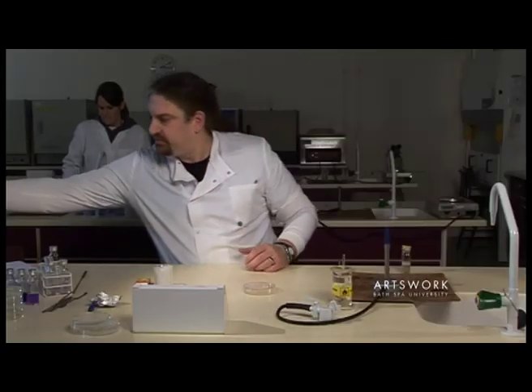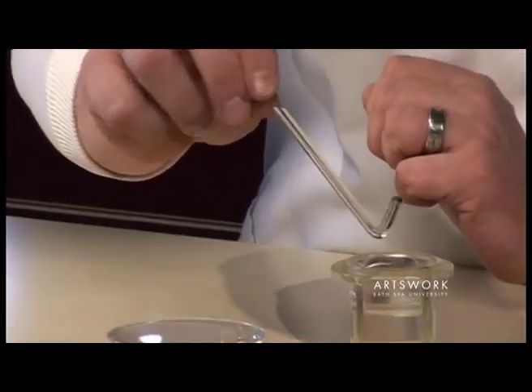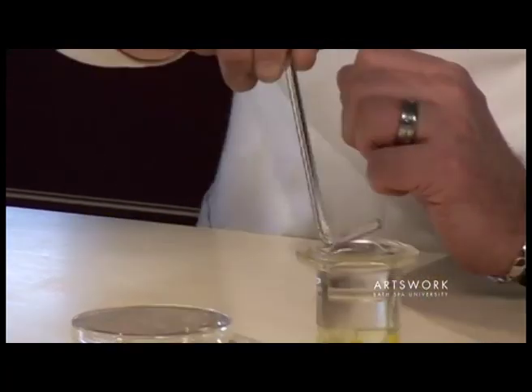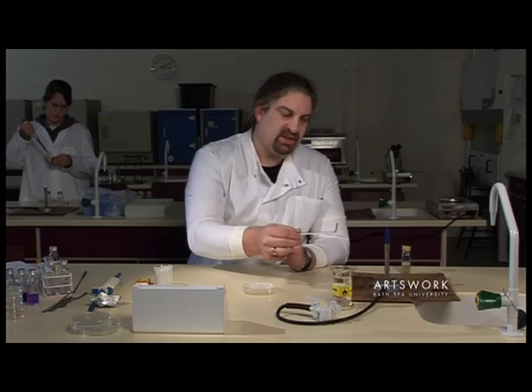Pop the lid back on, eject the tip, and to spread that we use a glass spreader. To sterilise it, this equipment is stored in alcohol. Tap off the excess and then simply pass it through the flame so that you set the alcohol alight.